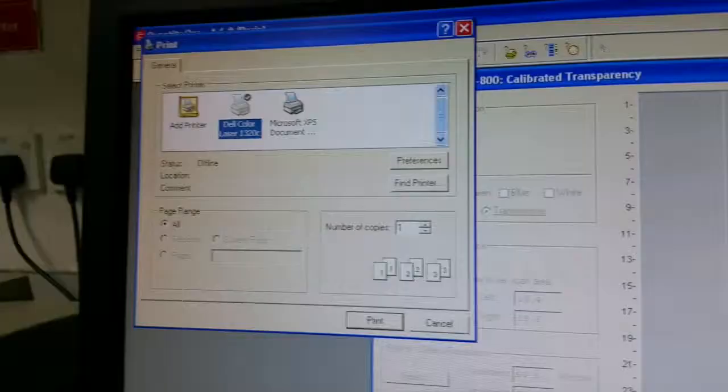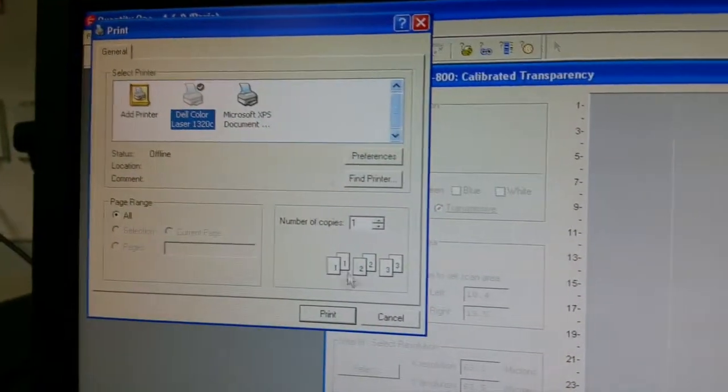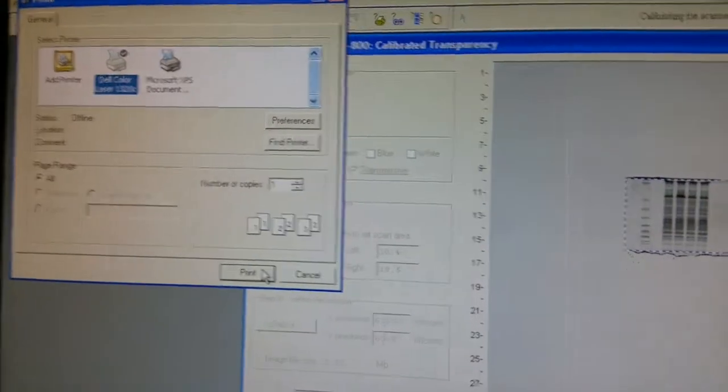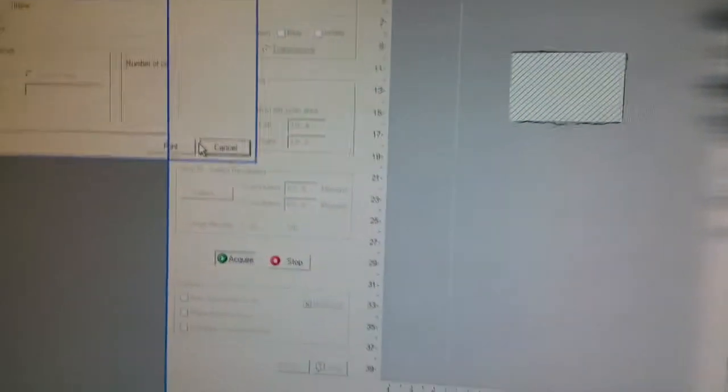Once you press Acquire, a dialog will come up. If you have a printer and want to print right away, go ahead. I don't have one — I just want to save a soft copy. Press Cancel, and after you press Cancel the process of acquiring that particular image will carry on.